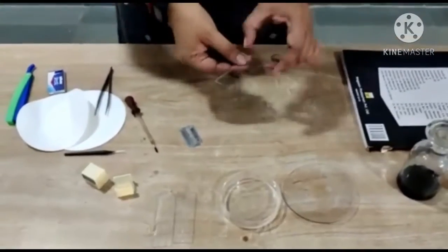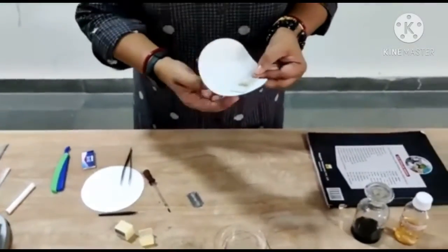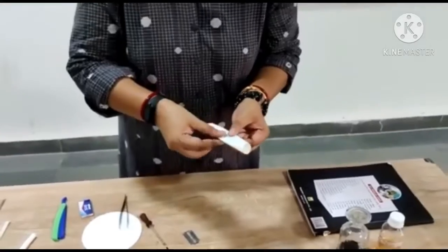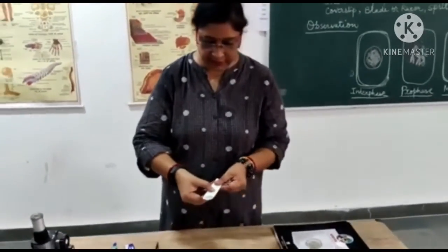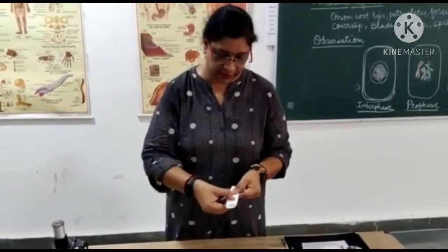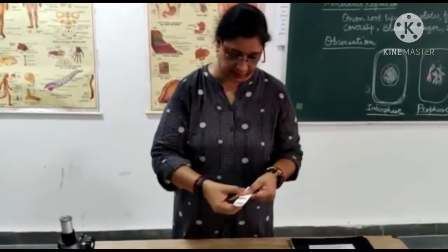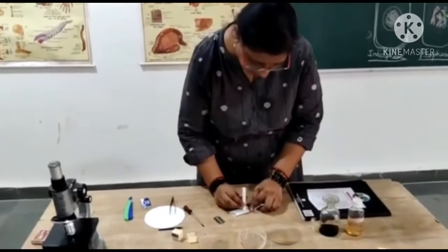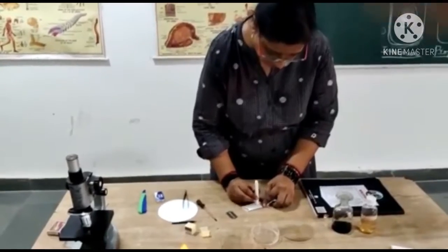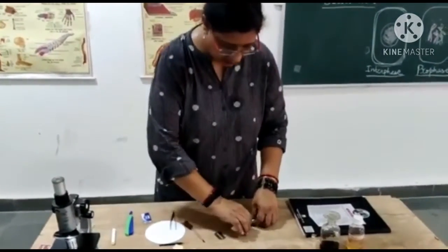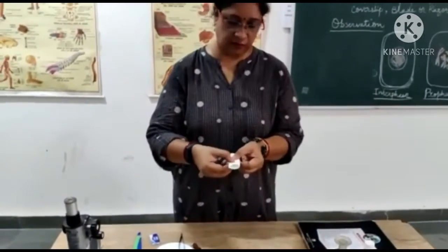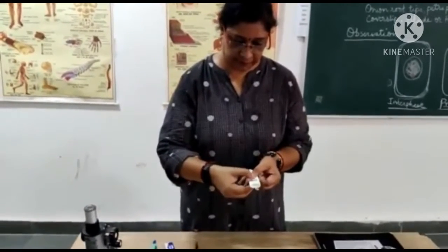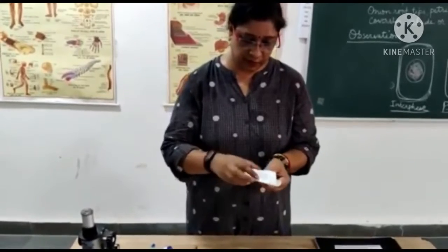After putting the stain and cover slip, we will wrap the slide in filter paper. And where the material is, we will need to pressurize very gently just to spread the cells to make the smear. You can tap it with some blunt object. Until and unless the cells are spread completely, you cannot observe the slide properly.